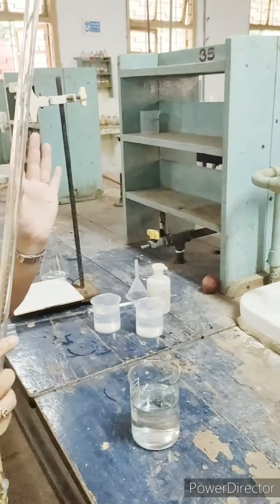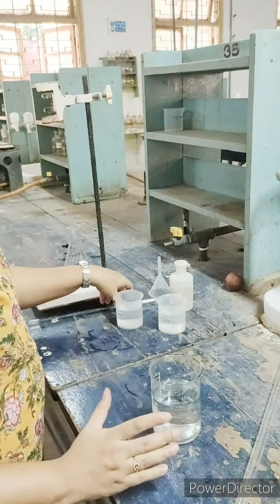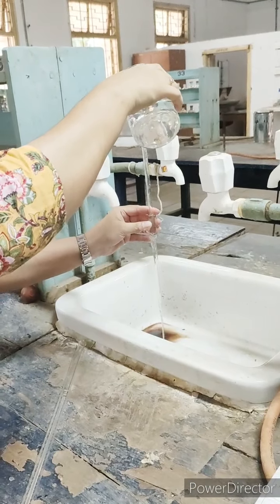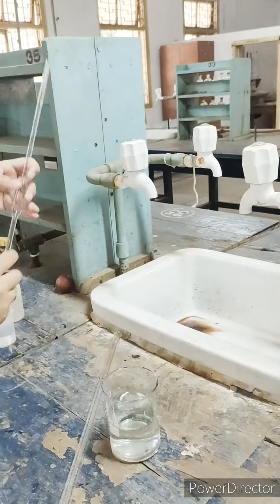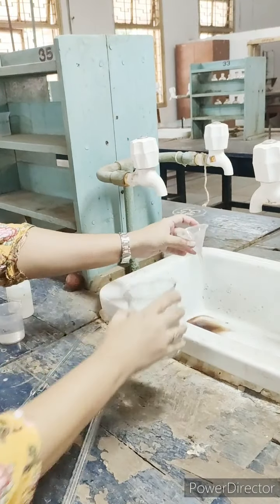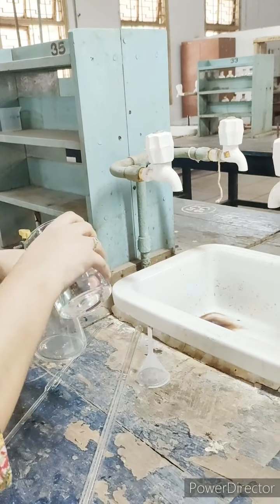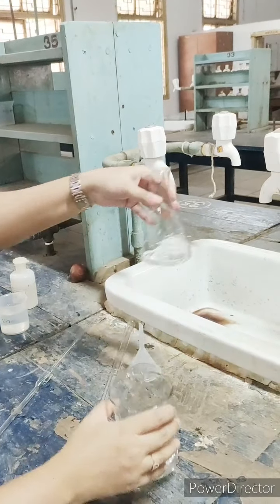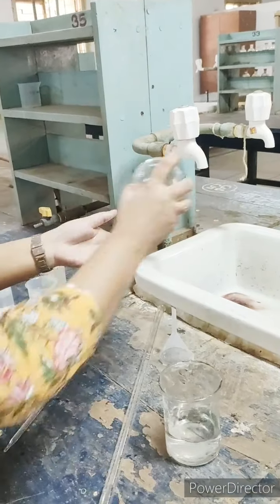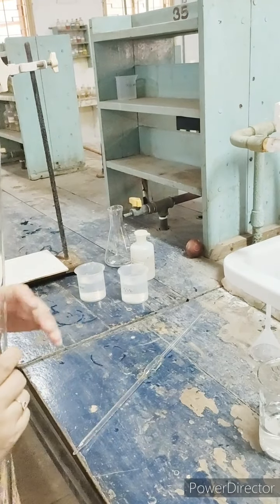Repeat this rinsing 2 or 3 times. I have already rinsed it, but to show you, I am doing this. Rinse your funnel because for every experiment you are going to use a different solution. Rinse your conical flask. After rinsing with water, we will rinse the pipette and the burette with their respective solutions.